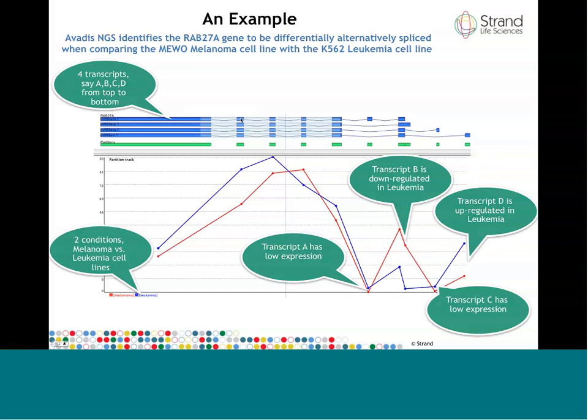And now if you have such junctions that are unique to a particular gene, then immediately you know that that read comes from that gene. So you have a number of such clues that tell you, at least for a subset of the reads, which transcript they come from. And then once you've seeded your deconvolution with those reads, you extend them to the other reads by splitting the other reads in the same proportion in some sense.